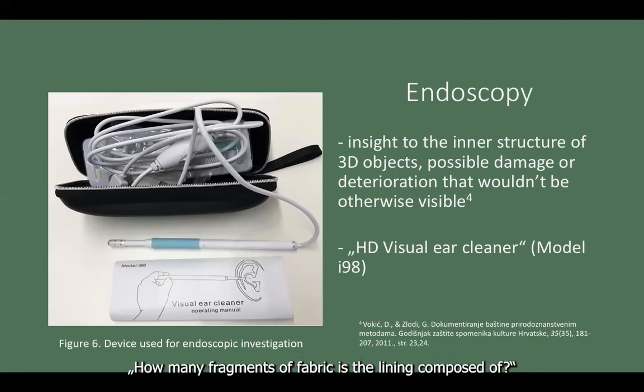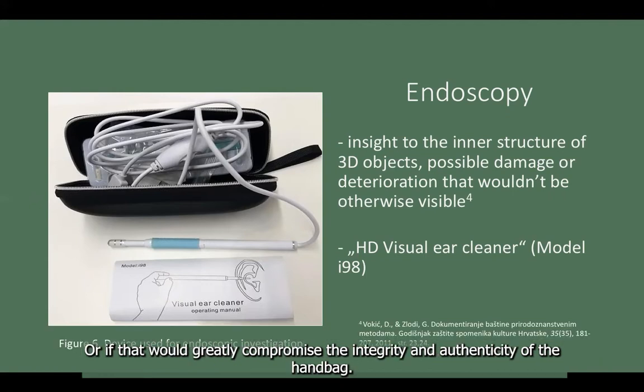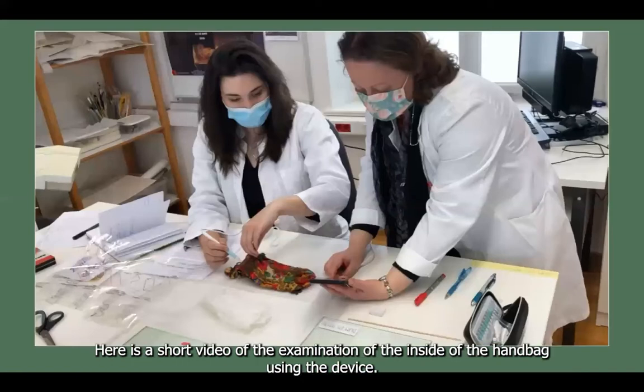Or how many fragments of fabric is the lining composed of? Answers to these and similar questions were important because based on the information obtained, a decision was to be made about whether or not some elements of the bag could be separated if needed, or if that would greatly compromise the integrity and authenticity of the bag. Here is a short video of the examination of the inside of the handbag using the device.